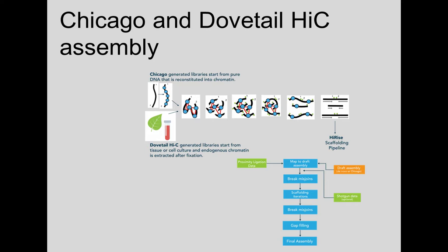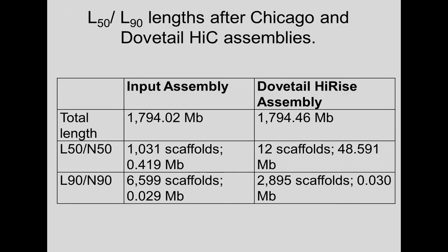So that's where we contacted Dovetail Genomics to carry out the Chicago and Dovetail Hi-C assembly, and we were fortunate to get this project funded through matching grants. I'm not going to go over the details of Chicago and Dovetail Hi-C because Mark already gave a very good overview of how these techniques work.